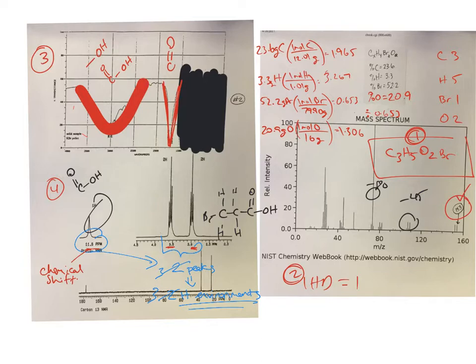So then if I look at the rest of my NMR, I see these 2 peaks, and they're each for 2 hydrogens. So that's the last thing we get, this integration, right? So this gives us the number of hydrogens in each peak, and that is the integration of that line. Number of hydrogens in each environment. That also helps us realize the one peak is the H from an OH, specifically the carboxylic acid. The other 2 peaks are both for 2 hydrogens, okay?